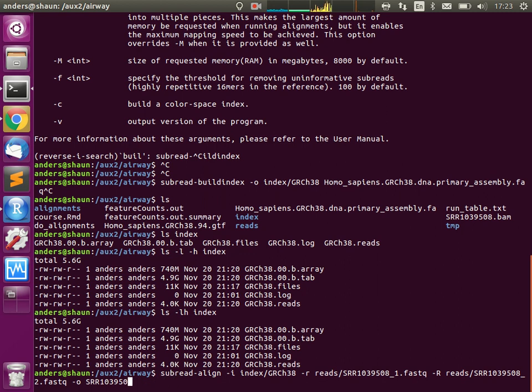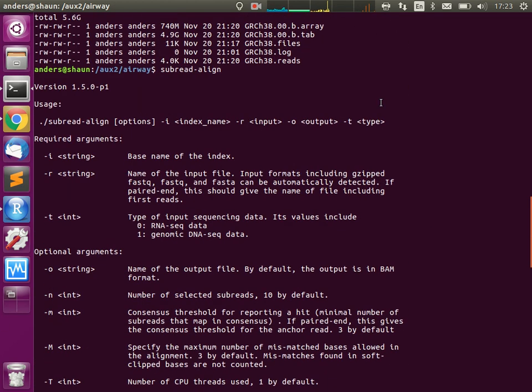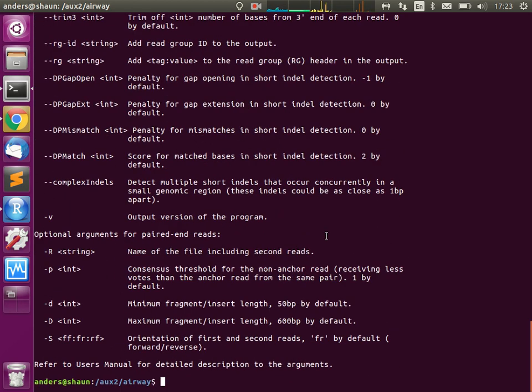-t o, which is a bit unusual, but if you go back, you remember if you type this just like this, you get all these explanations. Yeah. And of course, there's a 20-page manual which explains all these things in a bit more detail. What we also did last time is I was a bit worried that if I now want to align all these 16 files, I might start messing things up.